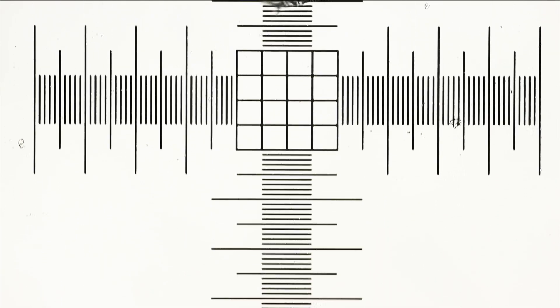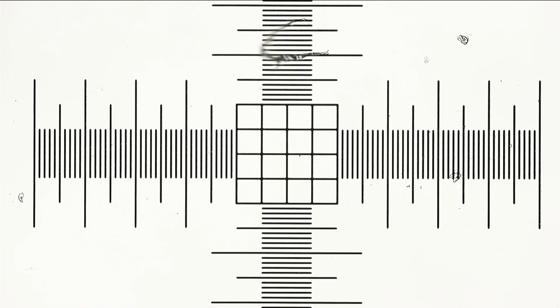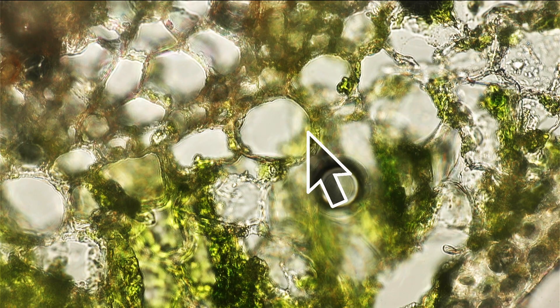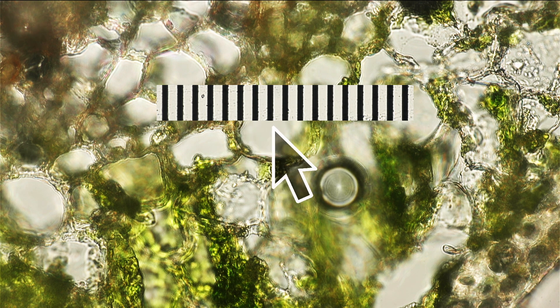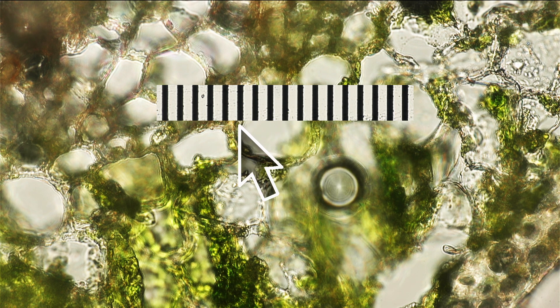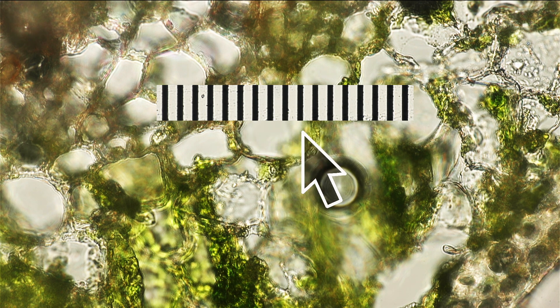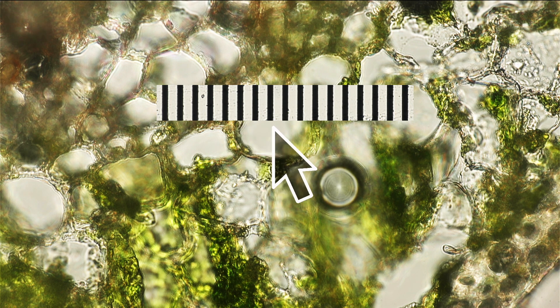And now how do you measure the diameter of the cell? Well, I used a so-called micrometer slide. This is a special slide that contains an engraved very fine small scale, and the distance between two of these lines is 10 micrometers. It's ten millionths of a meter. And I took an image, a picture of this scale, and I superimposed it on a picture from the cell, everything of course without changing any magnification.